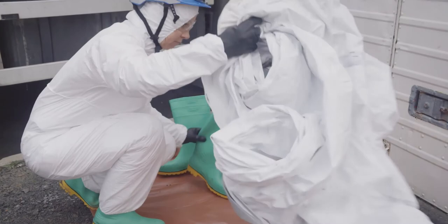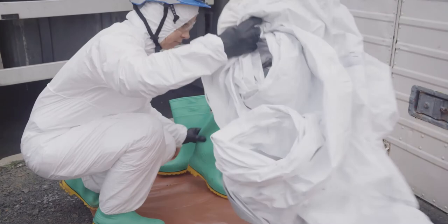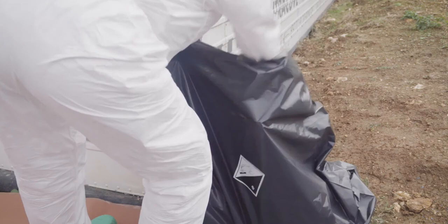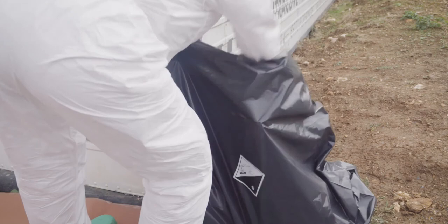The colleague rolls up the contaminated coverall and the tape and places them in a hazardous waste pack. Even if it is not contaminated, the coverall is single use and must be disposed of.